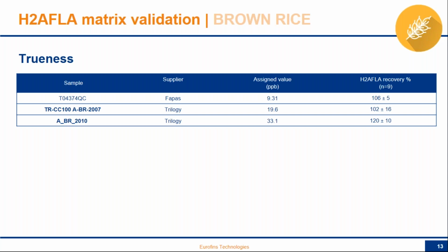We found a little overestimation for 1 sample at 30 ppb. We do not think it is related to the concentration, but rather probably to the material. Sometimes it happens. While the materials at 10 and 20 ppb were found to be very accurately dosed.